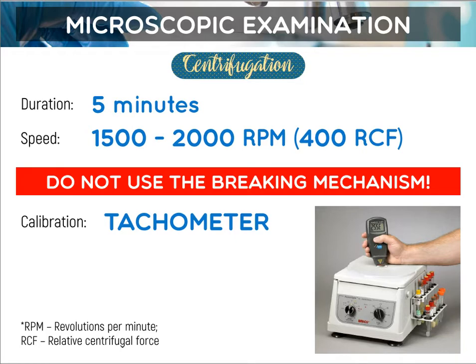Na mo stop ang centrifuge kay ma-disrupt man ang imuhang sediments na form. So inyo siyang ikalit og stop, ma-shake na pud niya to, magbalik na pud niya kag centrifuge. Okay, so its calibration is the tachometer, kanang naa sa picture. So ang tachometer is an instrument measuring the rotation speed of a motor, sa ato ang centrifuge.